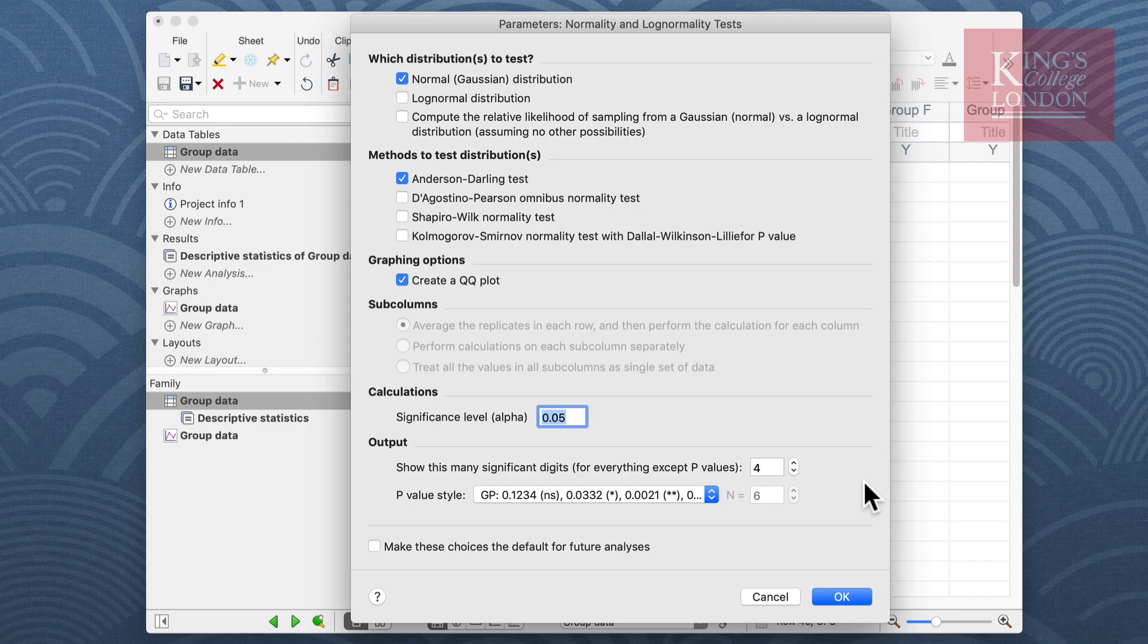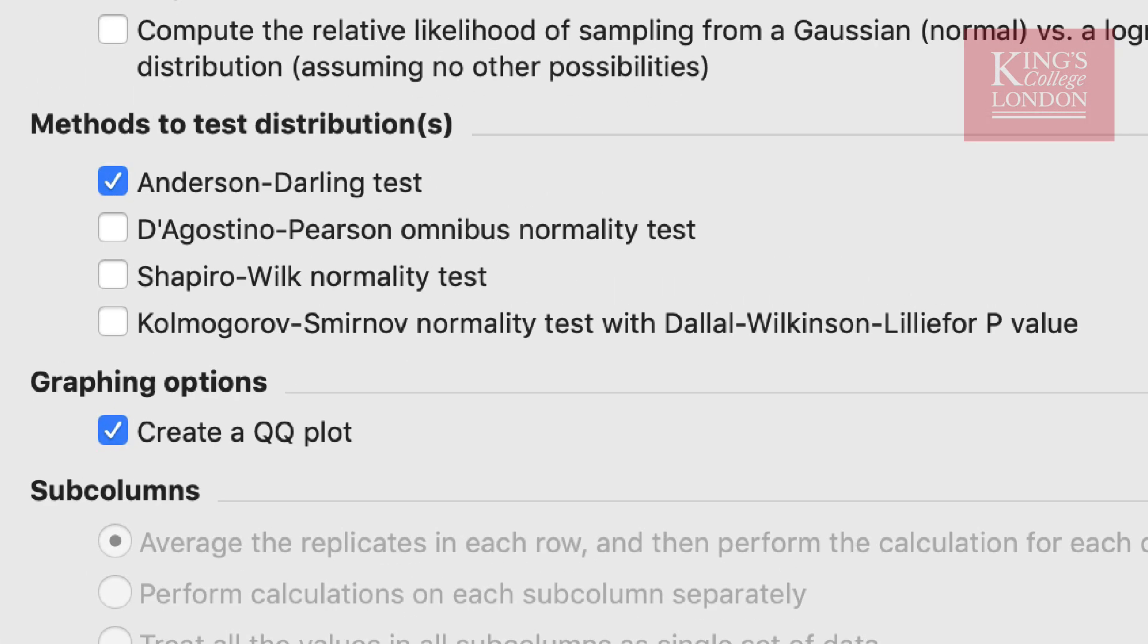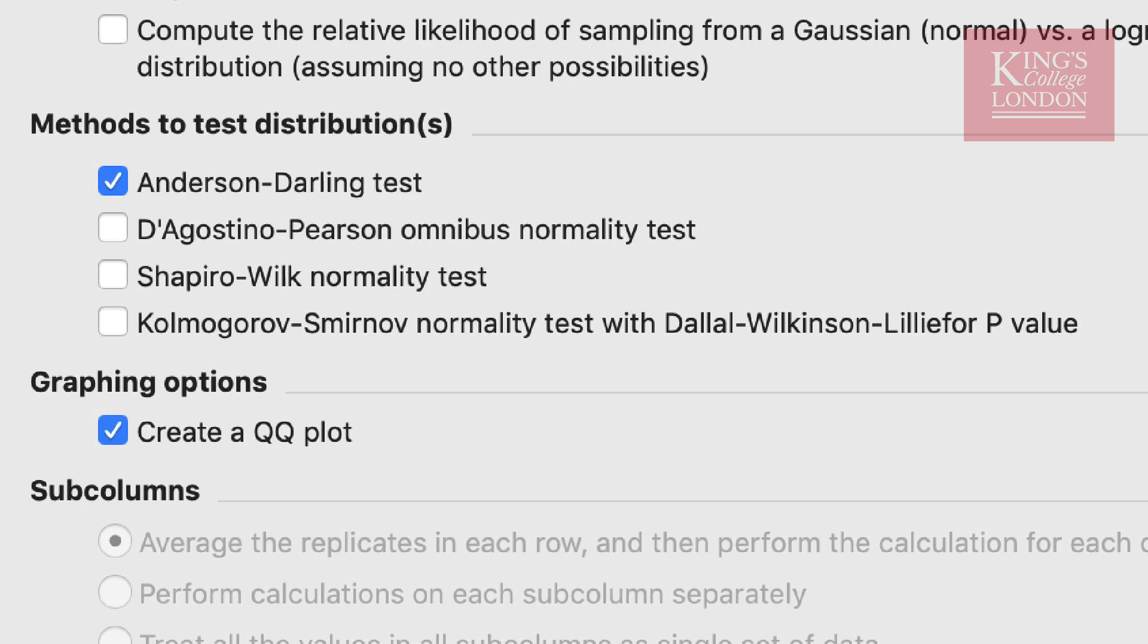We actually recommend the D'Agostino-Pearson normality test. The one that Prism uses is the omnibus K2 test. The test is very simple and works out how far the distribution is from Gaussian in terms of asymmetry and shape, and then it calculates how far each of your values differ from the value expected with a Gaussian distribution. It produces a single p-value from the sum of these discrepancies which it then reports.